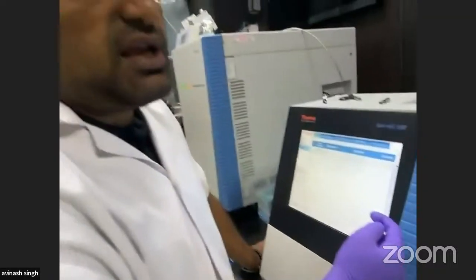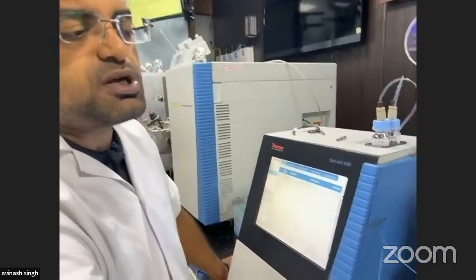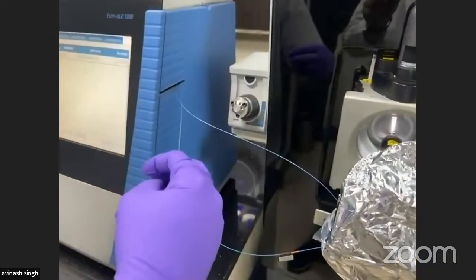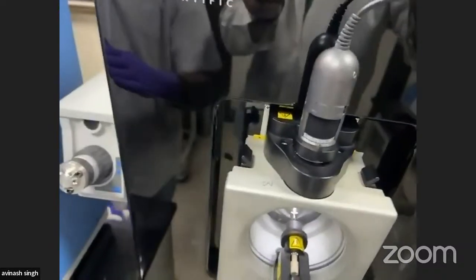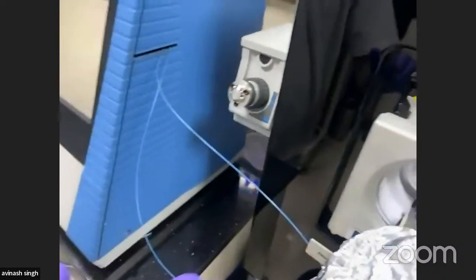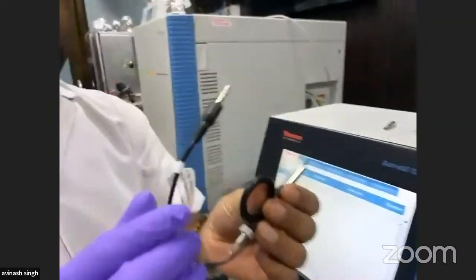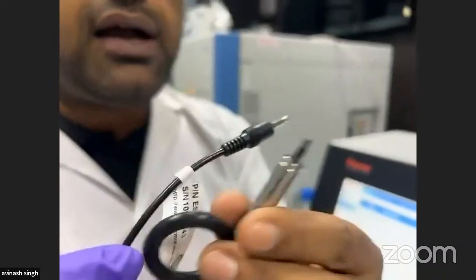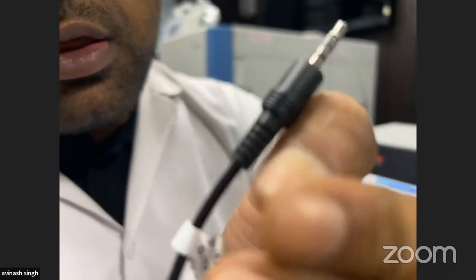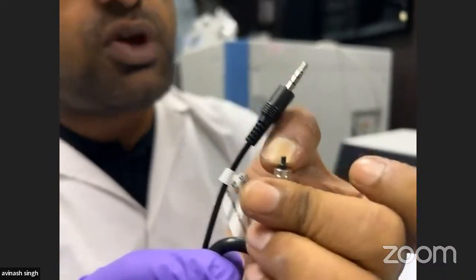So what does the nano LC do? It does the separation, it has a gradient. On the basis of the gradient, the solvent along with the peptide samples will come into the mass spectrometer slowly. So here you can see this is the mass spectrometer. There is a column. The columns are very important. So I have taken out one column for you. You can see this is a C18 column, and this is from where the spray happens. You can see the tip, this is the main source of the spray of the column.